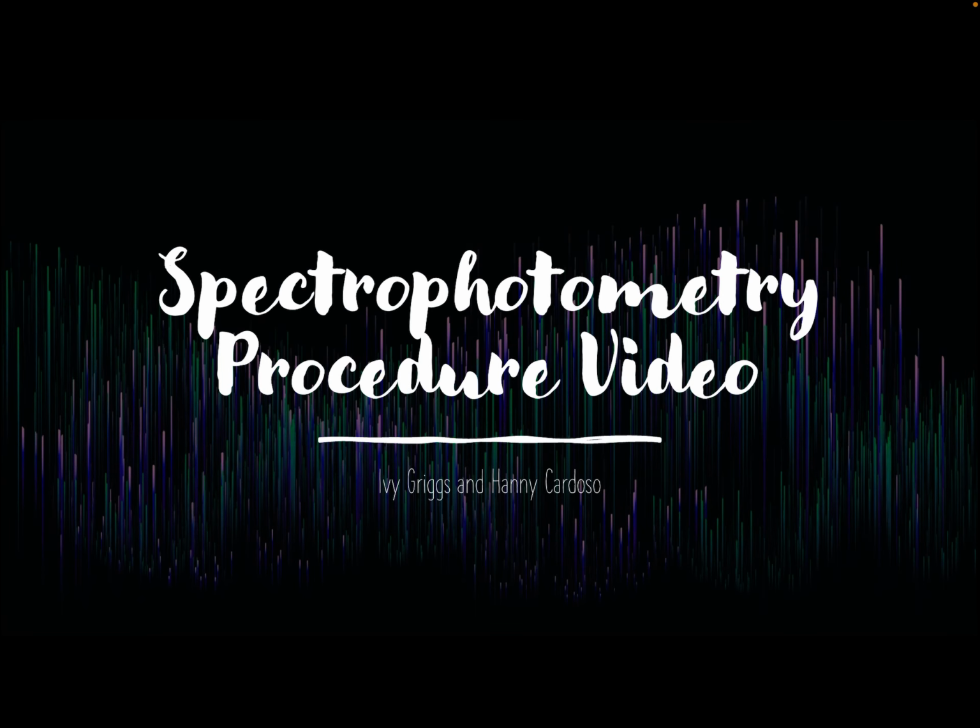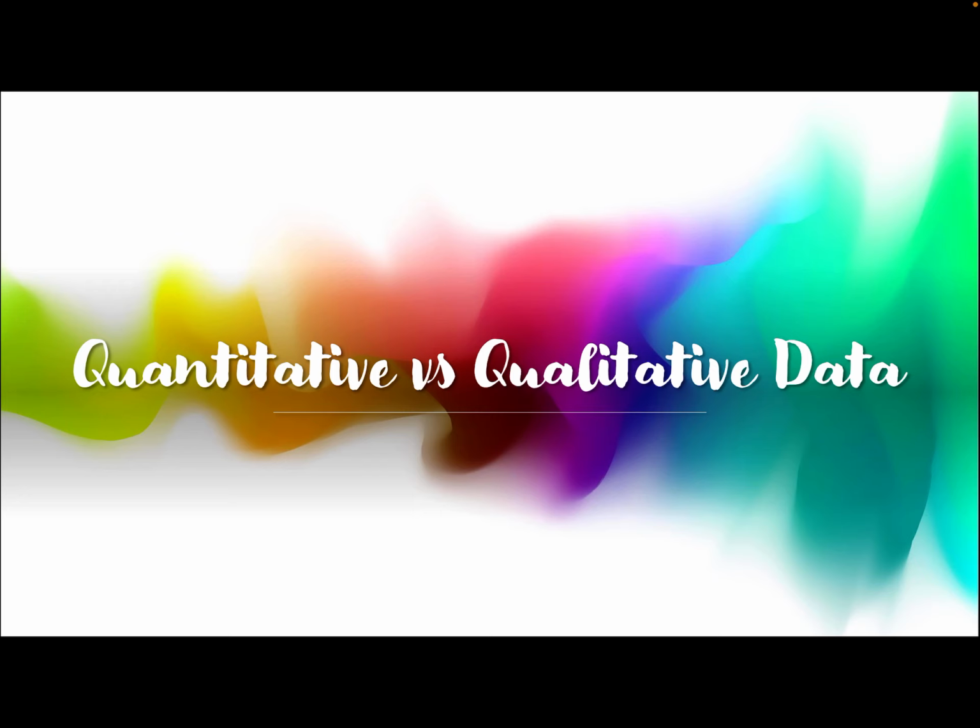So this is the spectrophotometry procedure video. First, we're going to talk about quantitative versus qualitative data.